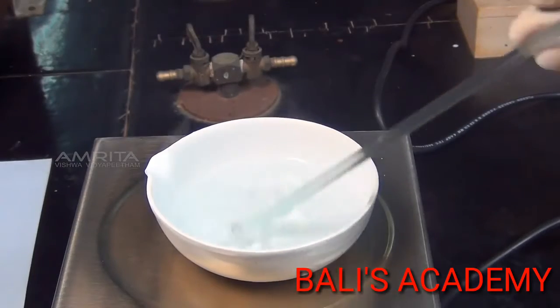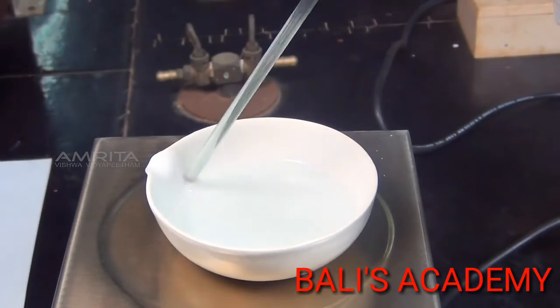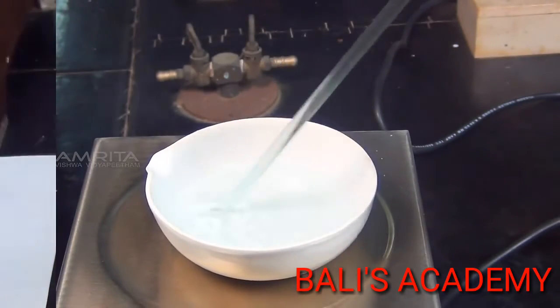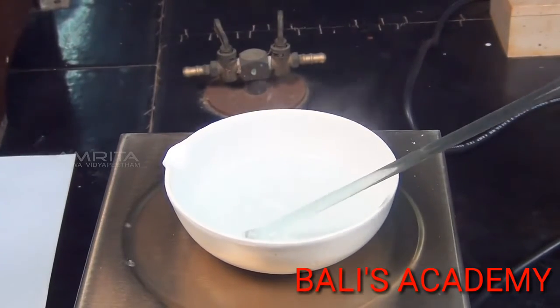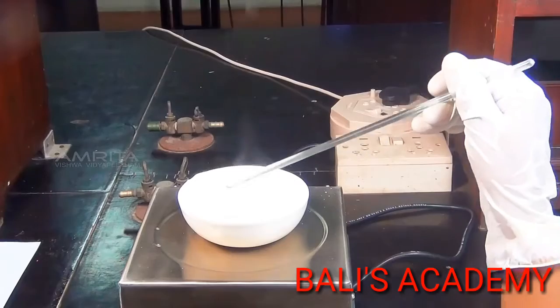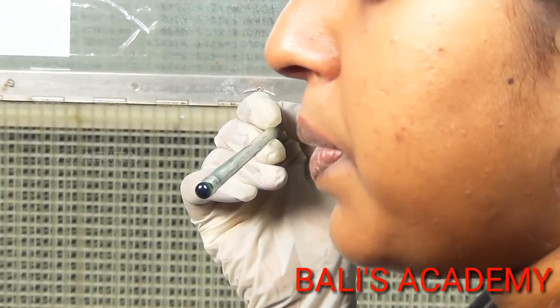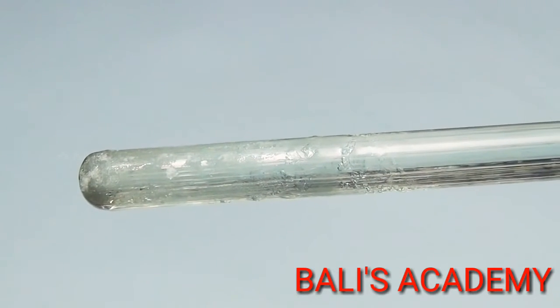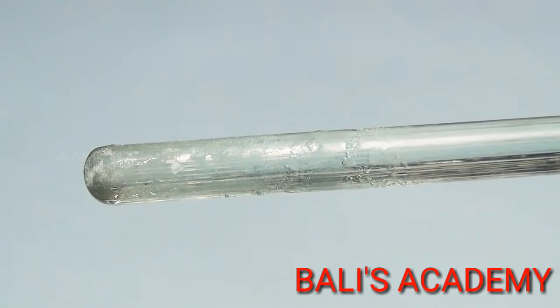To avoid crust formation on the side of the dish, stir the solution continuously with a glass rod. When the volume of the solution is reduced to about one half of its original volume, take a drop of the concentrated solution at the end of the glass rod and cool it by blowing. Formation of a thin crust indicates that the crystallization point has been reached.